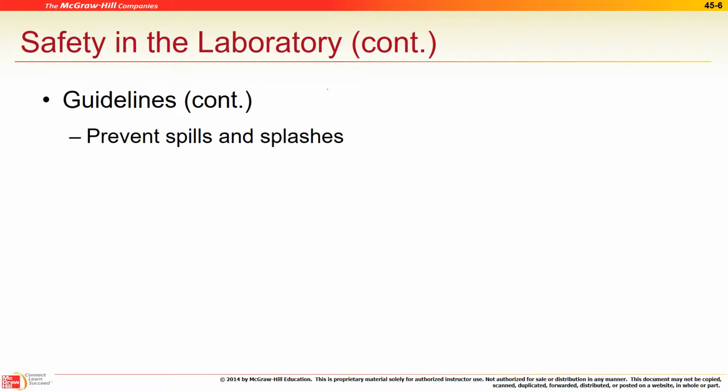Spills and splashes: number one thing is containment. Don't let it spread, especially if it's toxic or a biohazard. We do have fluorescent powder. We can mix that powder with a solution, make a spill on the ground, and then have you guys clean it up. After we're done, we shine a black light over the area and over the personnel to see if they were able to contain the infectious agent and not contaminate themselves. So we can do that exercise. We have spill kits for that as well.